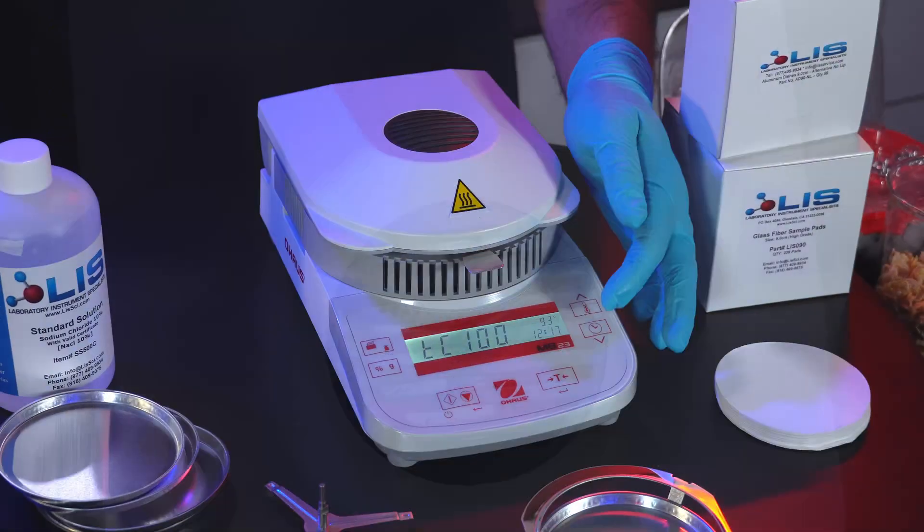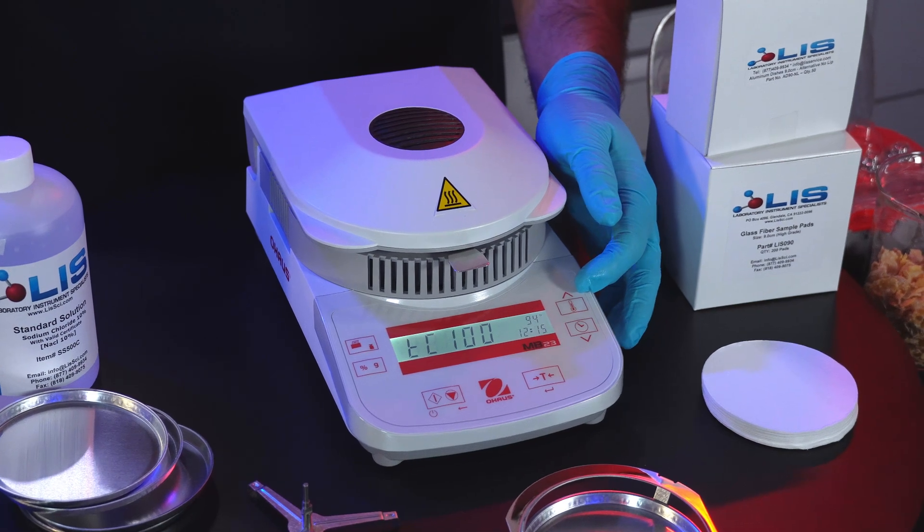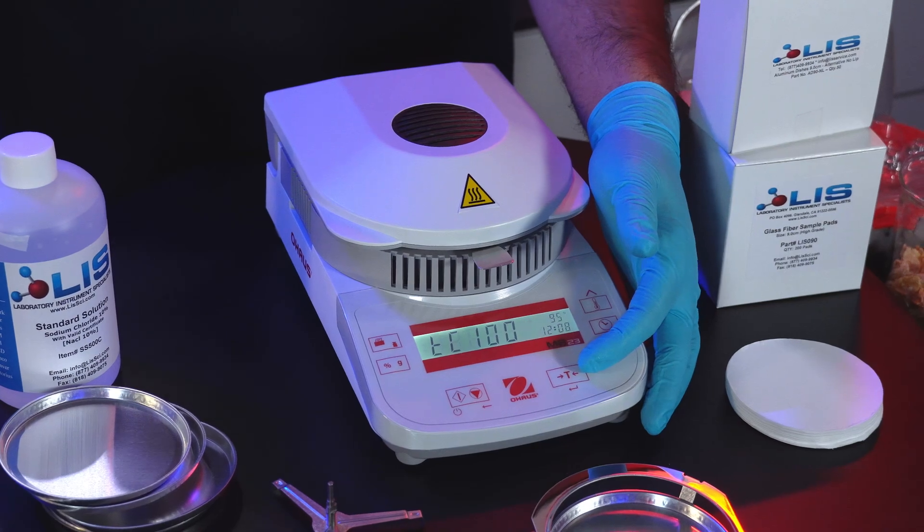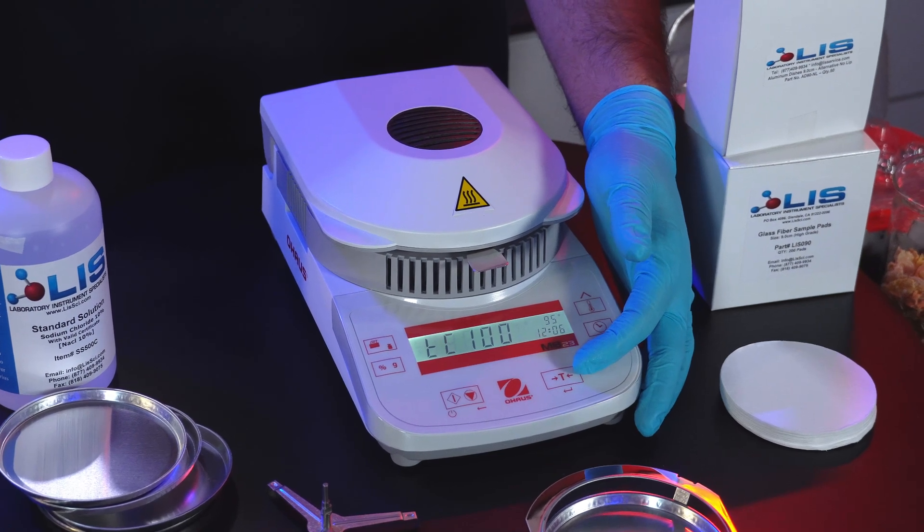If not, press the up and down arrow keys to make the instrument match. Once it has matched, press the tare button or enter button to accept that calibration set point.